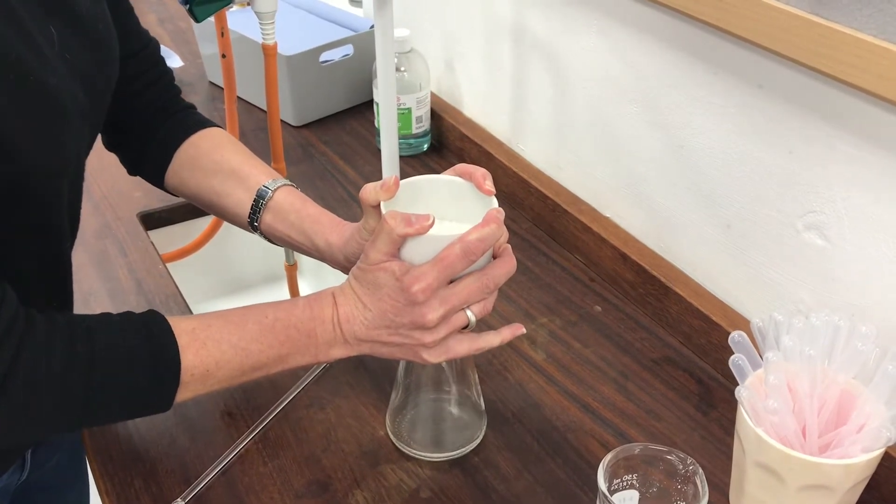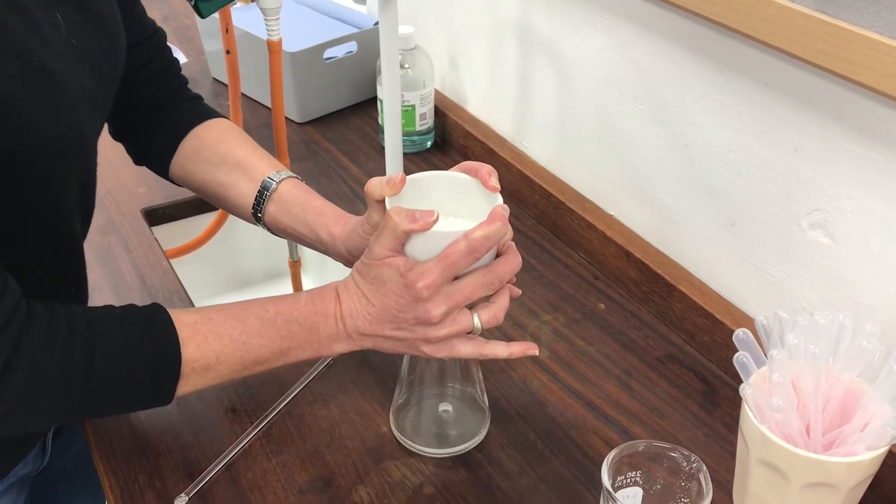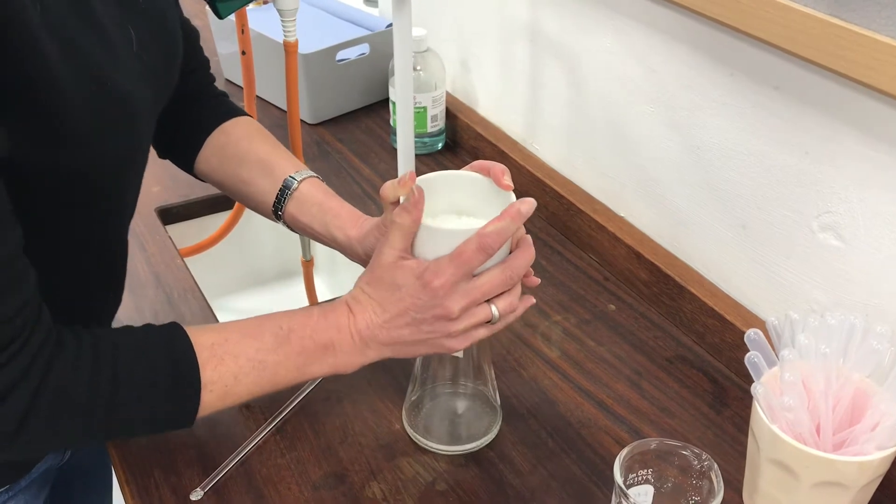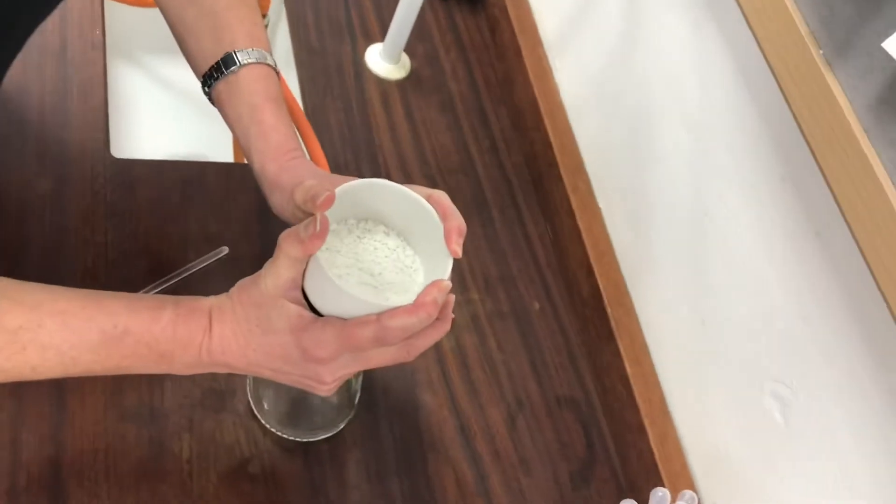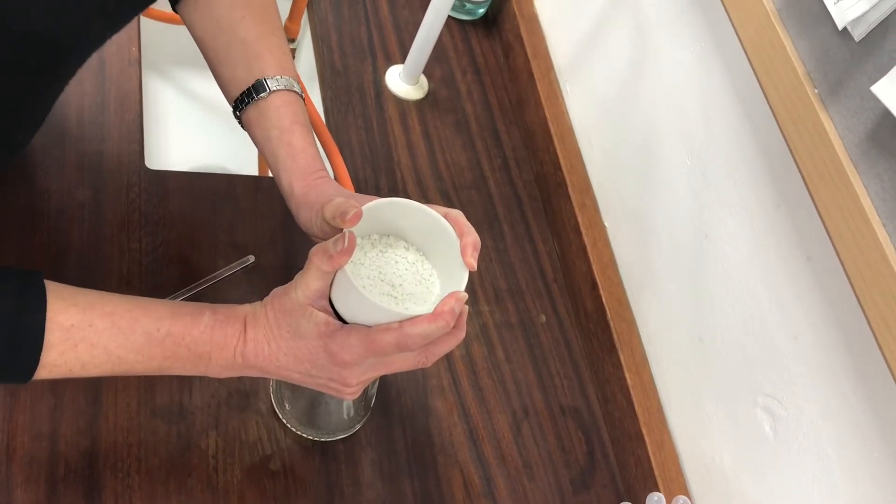I'm holding the Buchner funnel really tight down into the conical flask here to make sure there's a really good seal. And I get really good suction coming through my paper. So if you can see in the top of the funnel now, you can see there's lots of little nasty, gritty looking white particles of my product. And that's going to need recrystallizing.